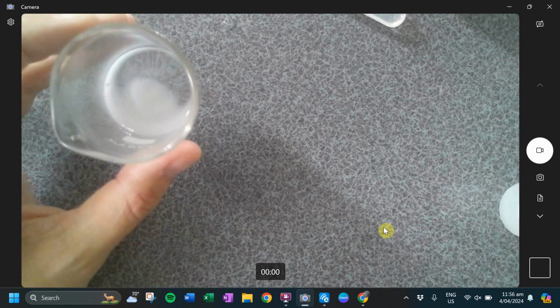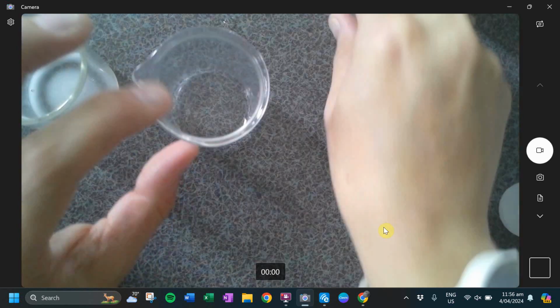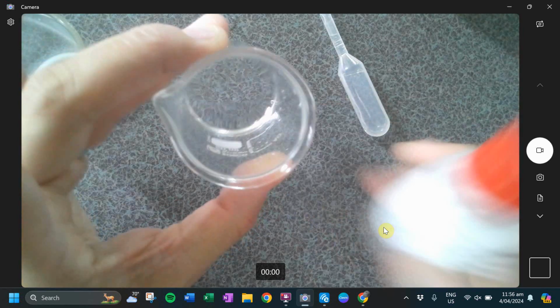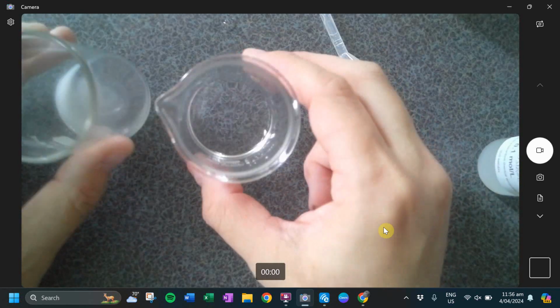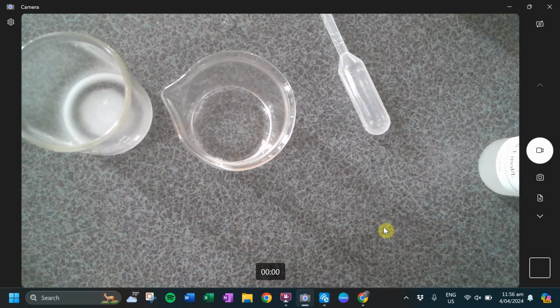That's what the precipitate should look like, right? But the one you guys had with your unknown and your barium nitrate didn't do that. So we can be very confident to say there's no precipitate here. Does that make sense? I am happy to grab you other reagents as a means to double check if you have the right response.